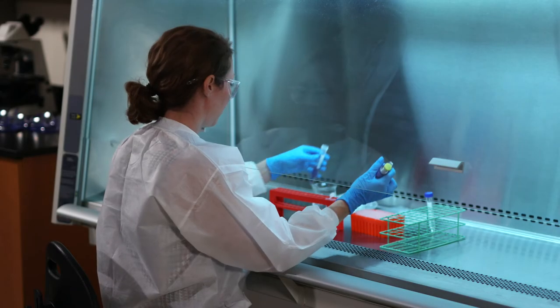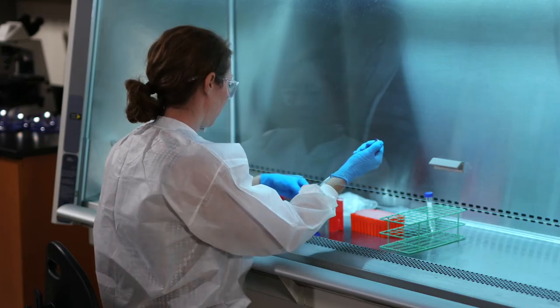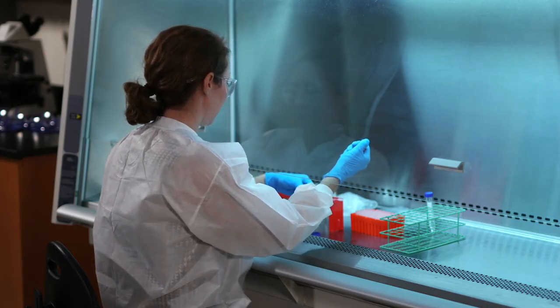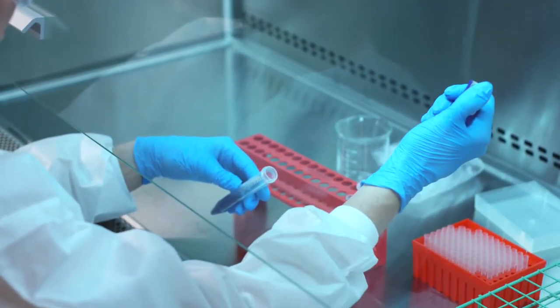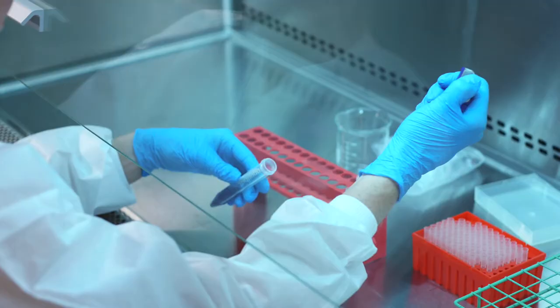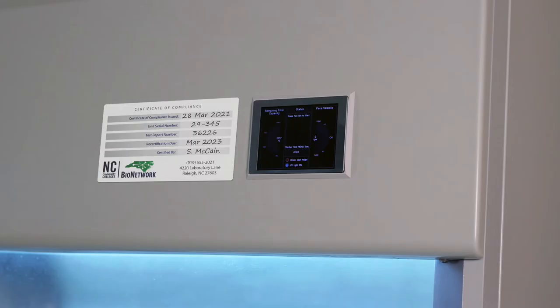A biological safety cabinet is used for working with infectious bacterial agents. The air flows through a HEPA filter to create a clean working environment, so it protects you, but also protects your work from contamination. This tag lets us know that the cabinet has been inspected and certified.